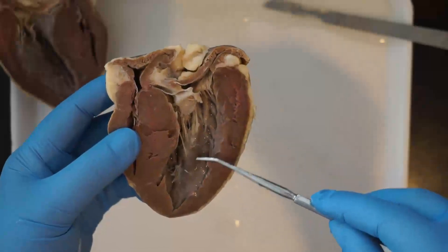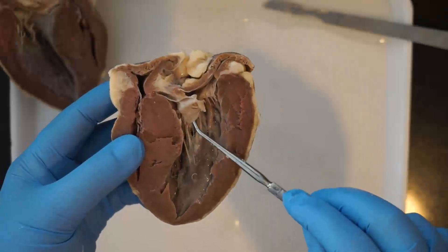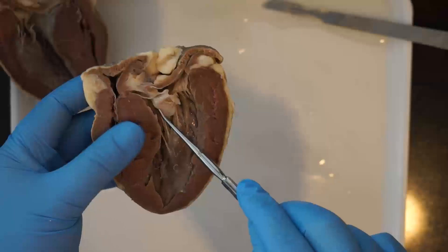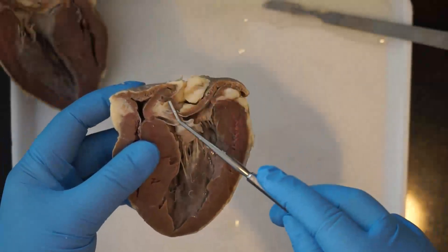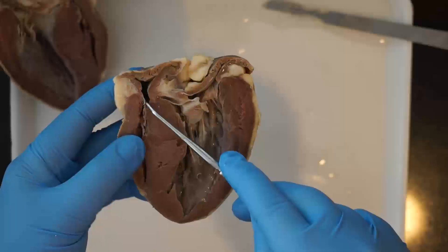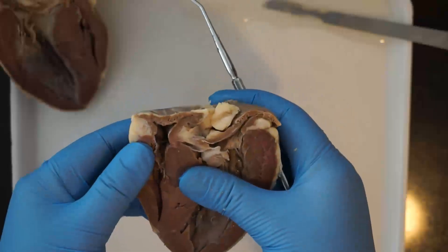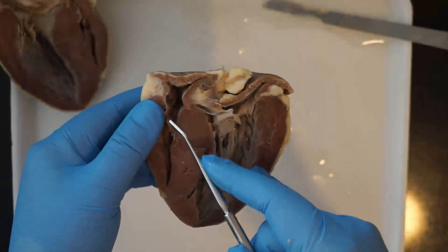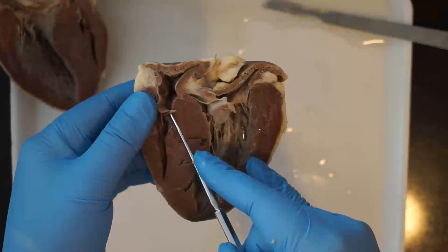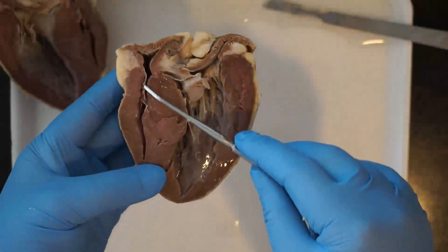Blood flows down from the left atrium into the left ventricle through that bicuspid valve, and then goes out to the rest of the body through the aorta. After it comes back, having dropped off that oxygen, it's deoxygenated blood now coming back into the right atrium and then into the right ventricle. There's a valve between those two chambers as well — that's the tricuspid valve. The valves are responsible for keeping blood from moving backwards through the chambers of the heart, keeping it going in the correct direction.